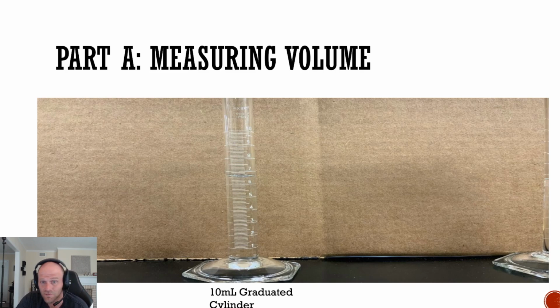All right. So I'm kind of going ahead and giving you this first one. Whichever one you decide is fine. I think you have a little bit of error, but make sure you read things the same way every time. If you tend to favor going up, always favor going up. If you tend to favor coming down to the one below it, always favor coming down below it. Be consistent and your answers will be consistent as well. Okay?